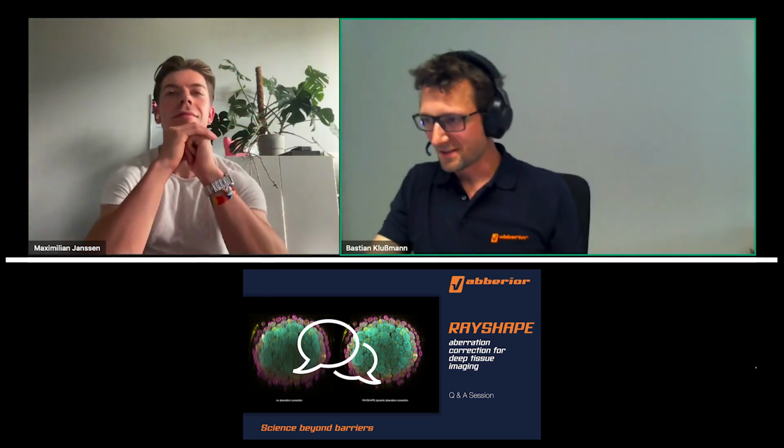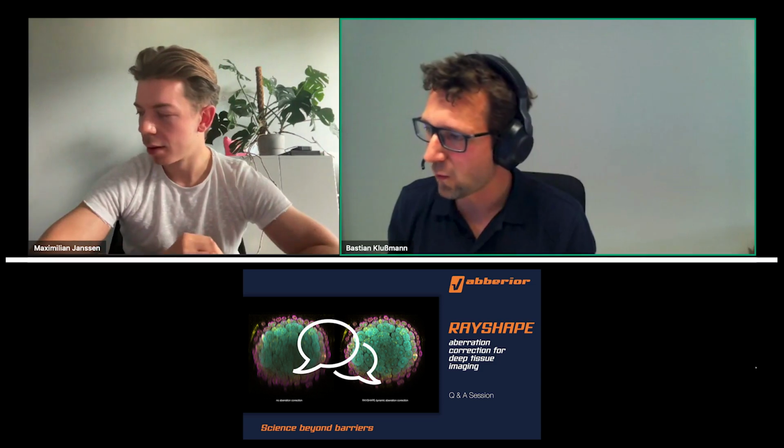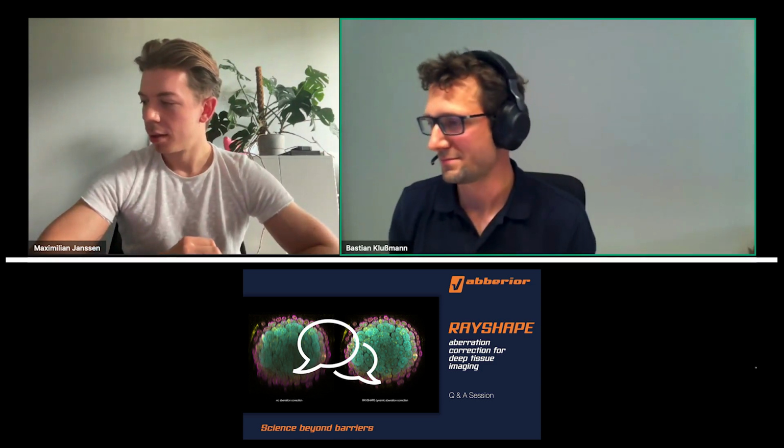Here we have another question for you. Here it states, a stupid question from a non-specialist. How many exemplars of brain cells can commonly be obtained from one human for research? Thank you.